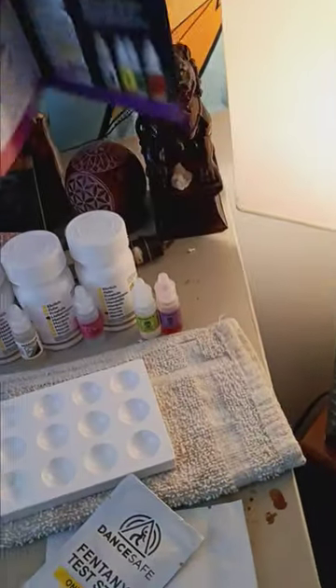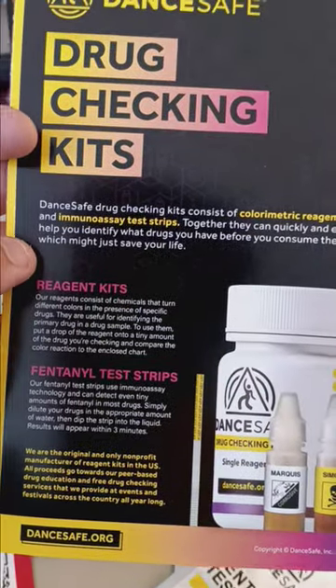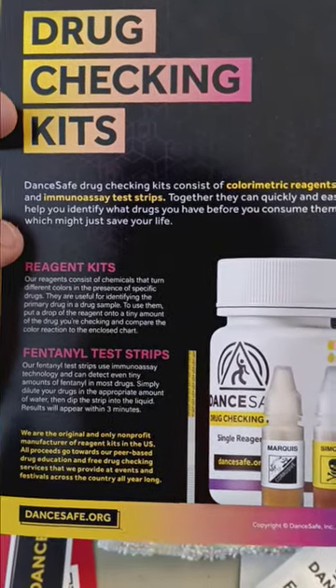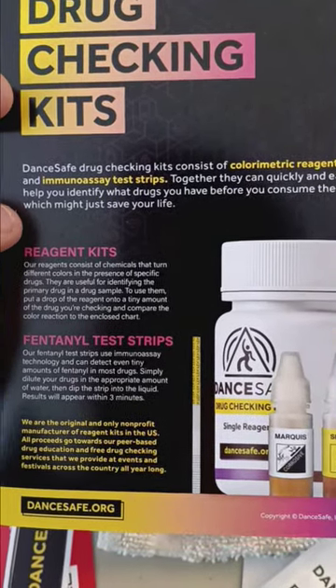So that being said, let's go ahead and take a look at this pamphlet here. This is what you get in the box. Drug checking kits: our reagent kits consist of chemicals that turn different colors in the presence of specific drugs. They are used for identifying primary drugs in a drug sample. To use them, put a droplet of reagent onto a tiny amount of the drug you're checking, and compare the color reaction to the enclosed chart. It's a little informational guide on anything you can imagine — MDMA, LSD, ketamine, cocaine, you name it.